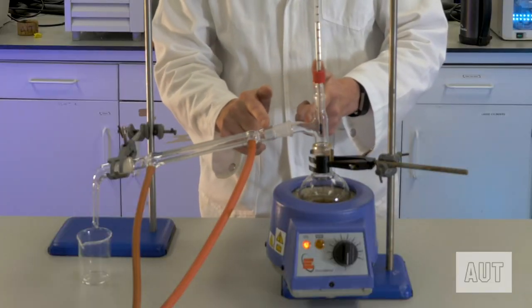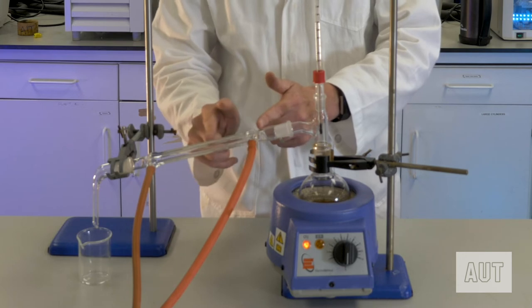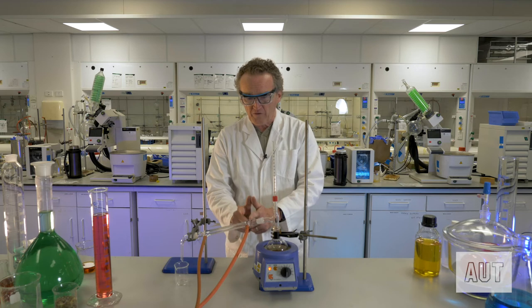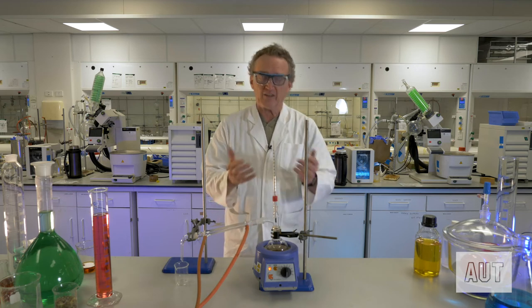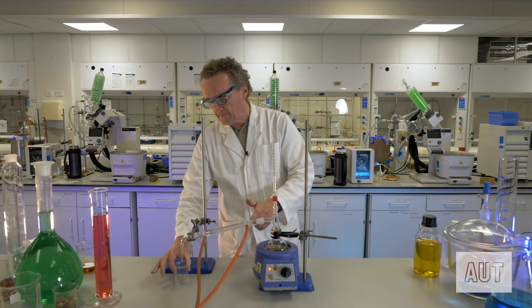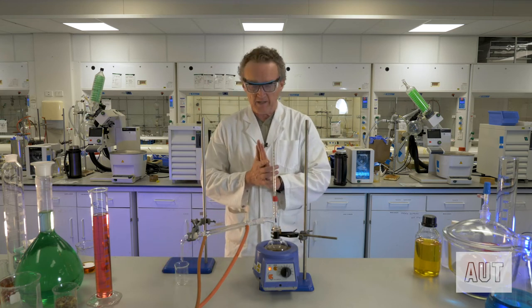It's still going to be a vapor, still going to be a vapor, and then all of a sudden it hits this cold tube that's got cold water flowing through it. And then it's going to condense, hence the name condenser, and it's going to trickle down here, trickle out the receiver adapter, and into your beaker.